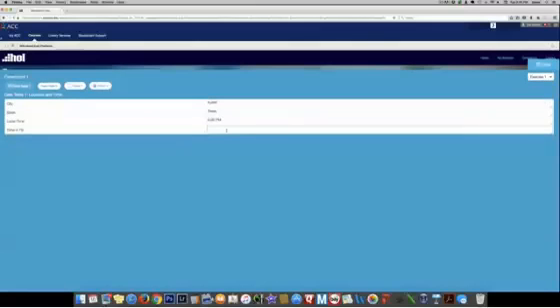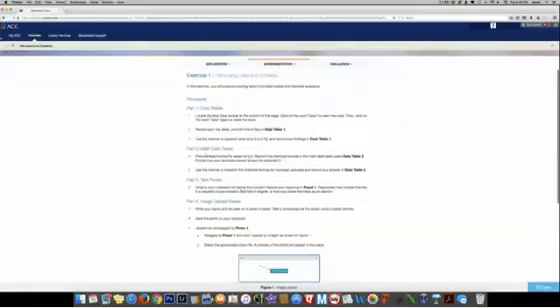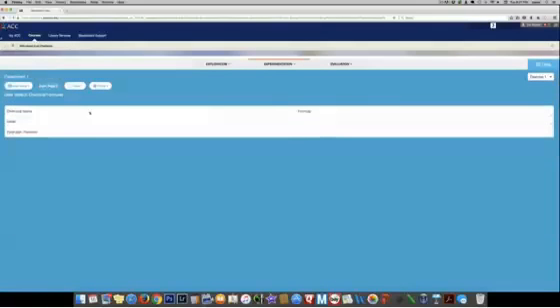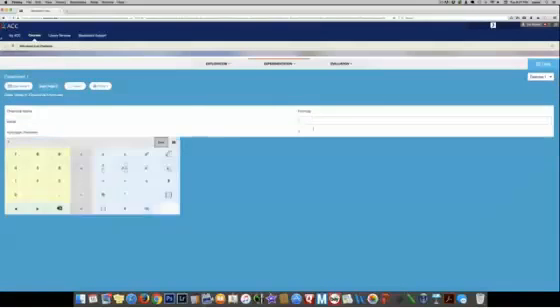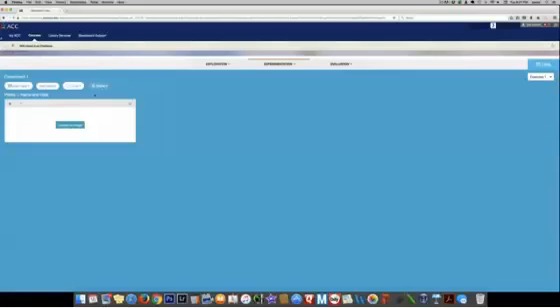I'm not going to take the time to look at it. Let's just do that for now. Hopefully you'll actually look it up. So we're going to close that data table, and then we go to part 2. You'll notice here it's referencing data table 2. So you click on data table 2 and fill out these particular fields. It's going to ask for photos in this case. You can upload a photo directly. In fact, let's just do that.